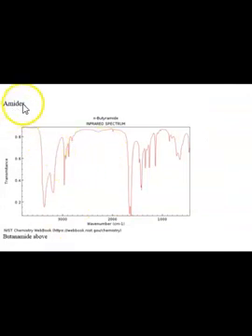And so now we have the amides. If you remember, an amide is a C double bond O, a carbonyl group, with a nitrogen. Okay, so this is very much like the alcohols or carboxylic acid. Notice the transmittance reading here is different. Okay, so you have 0.2 instead of percent, they just use the decimals. And then there's a C double bond O. We don't have a picture of the structure though.